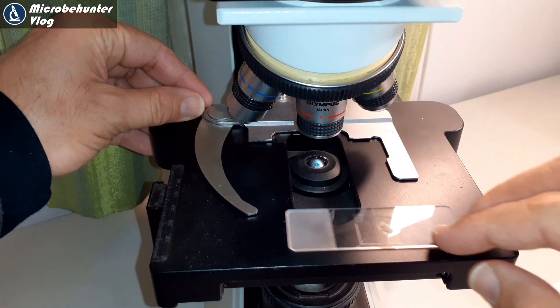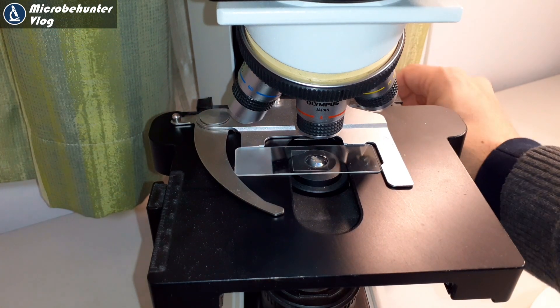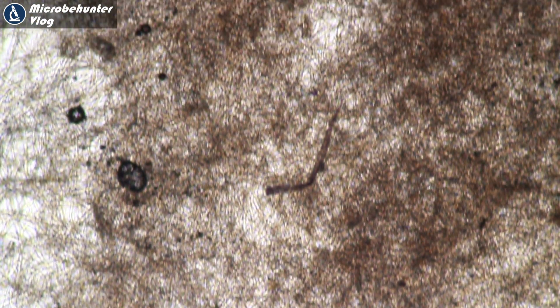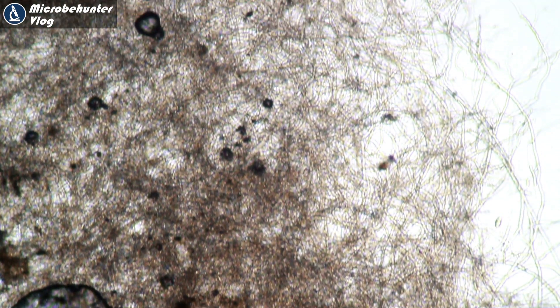So it goes under the microscope. We start with the low power 4x magnifying objective. And what do you see? Not a lot. As a matter of fact, the mycelium is so dense that you cannot even see the individual fibers — the hyphae, they're called. You shouldn't call them fibers; they're hyphae. And collectively, they make the mycelium.